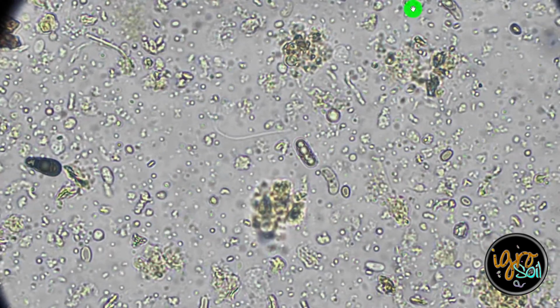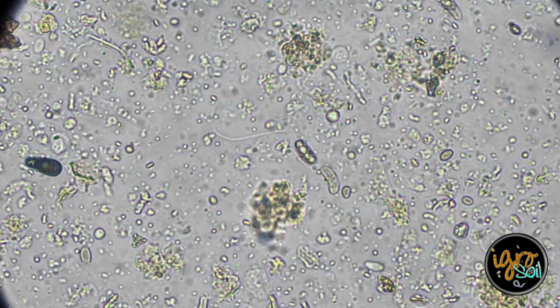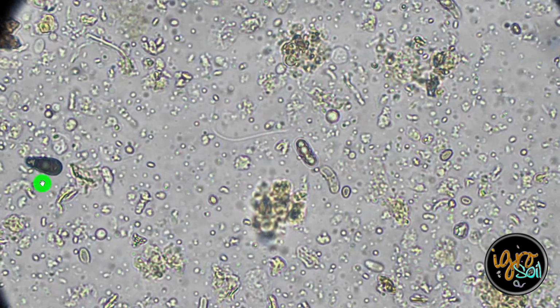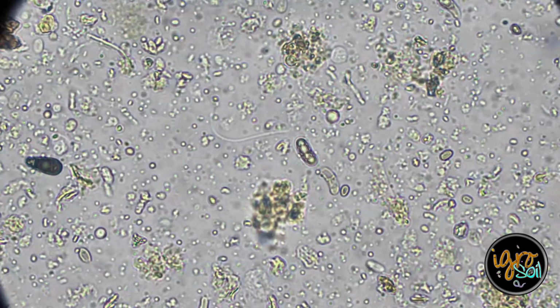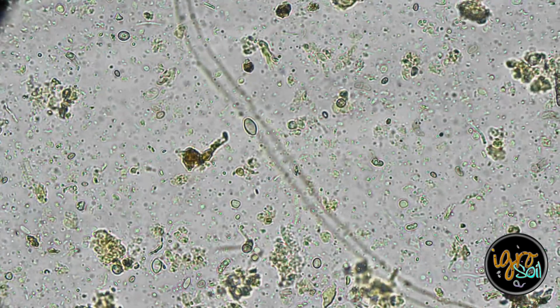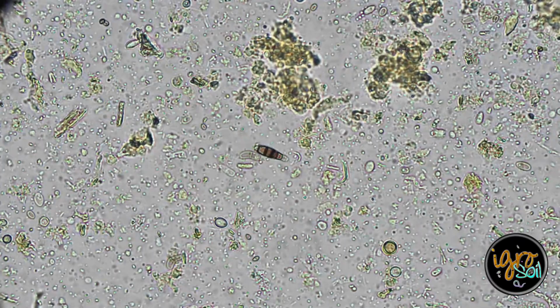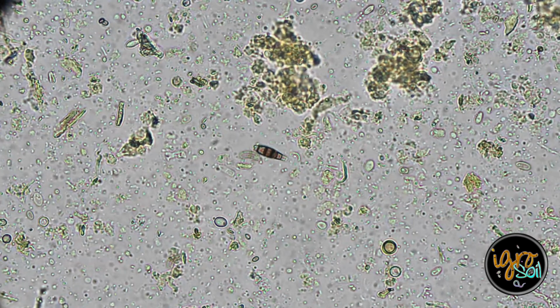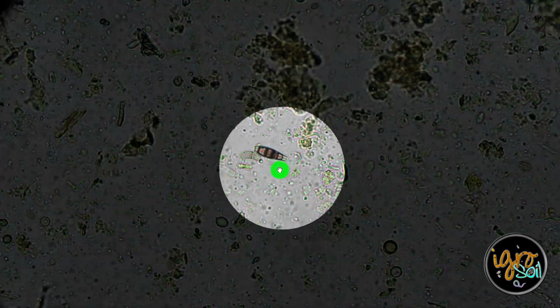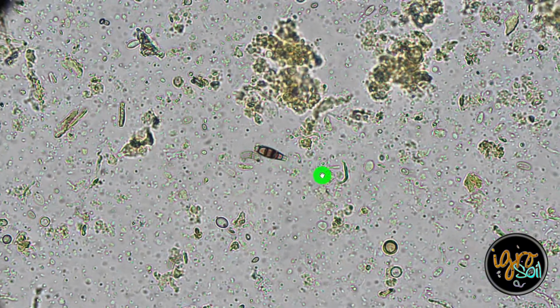Look at that. That's pretty cool. There's another spore. So this is loaded, right? This has got a lot of stuff going on. I'm going to get out of 600. I'm at 400, and I'm probably going to dump back to 1. There's more in here than I even understand. This is a spore that looks like it's actually sporulating, if that's the word. It looks like it's going to start growing out.